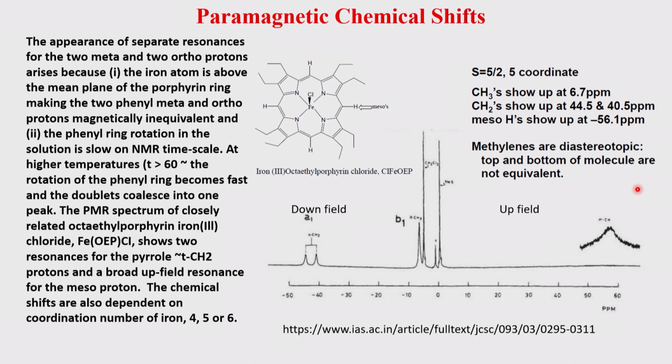That is why you get the 2 levels of the rings. So the B1, which is this, is for the CH3, and this is for the CH2s, and these are for this CH, and so on. So some are upfield, some are downfield.